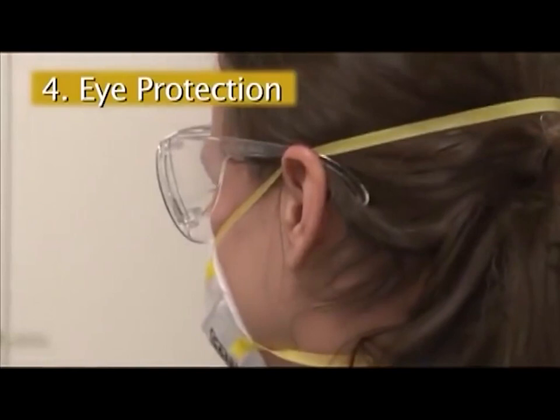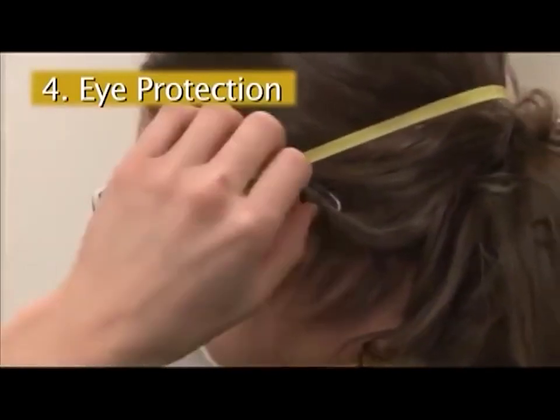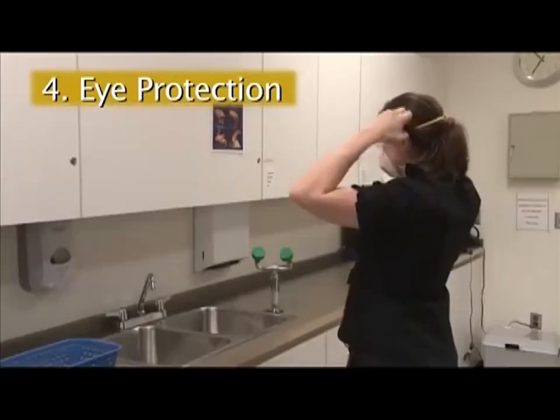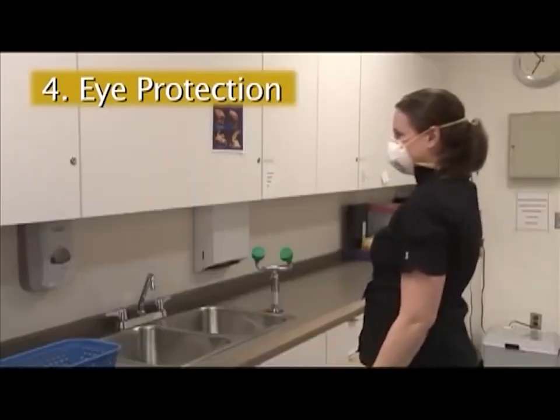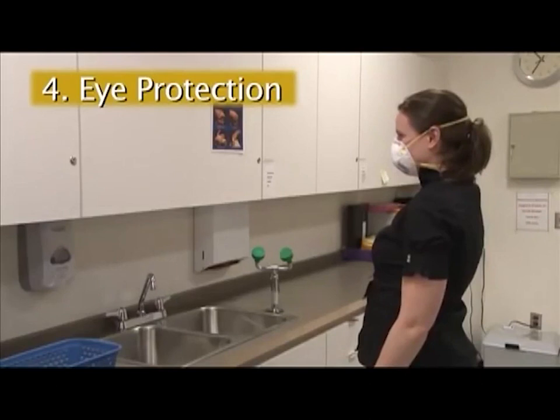The outside of the eyepiece is contaminated, so handle eyewear by the earpieces. Pull away from your face and place into a designated receptacle for cleaning. Personally owned eyewear may be cleaned by the individual.